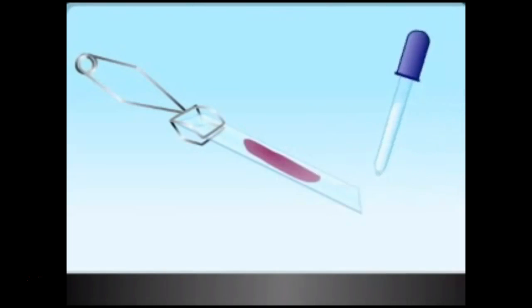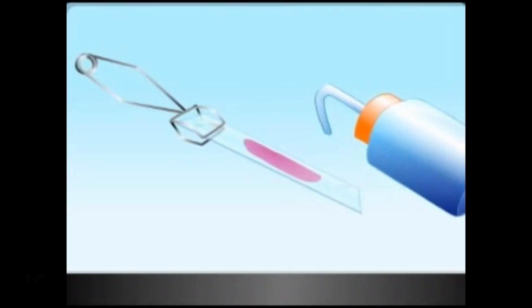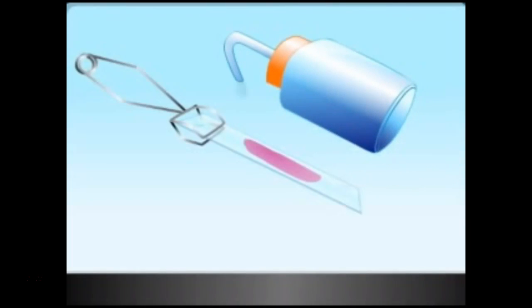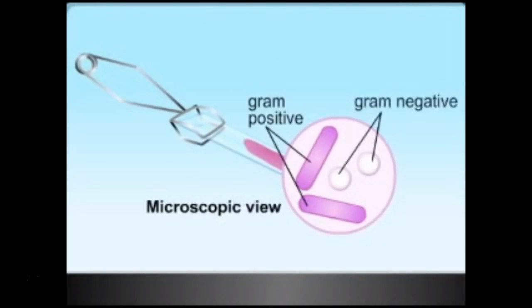The cells are then decolorized by washing with ethanol or acetone. This is the differential step. Gram-positive bacteria retain the crystal violet, whereas gram-negative bacteria do not. The ethanol or acetone should be added drop-wise, with the slide tilted at an angle until the drop coming off the edge of the slide just starts to become colorless. Even gram-positive cells can lose the crystal violet iodine complex during prolonged excessive decoloration. Excess ethanol is then washed off with water. When viewed under the microscope, gram-positive cells appear purple and gram-negative cells are colorless.